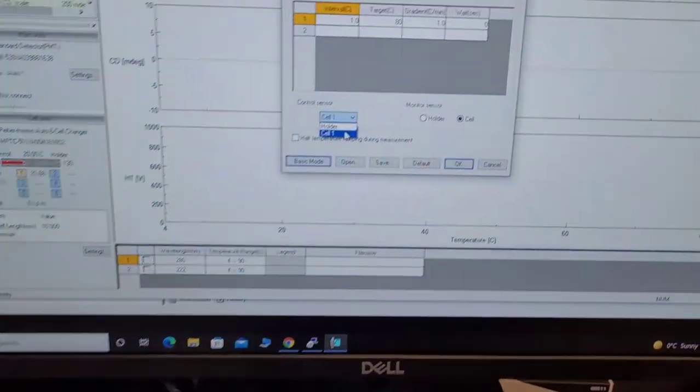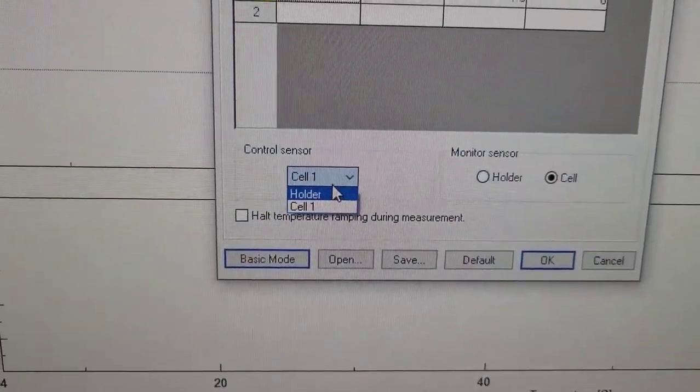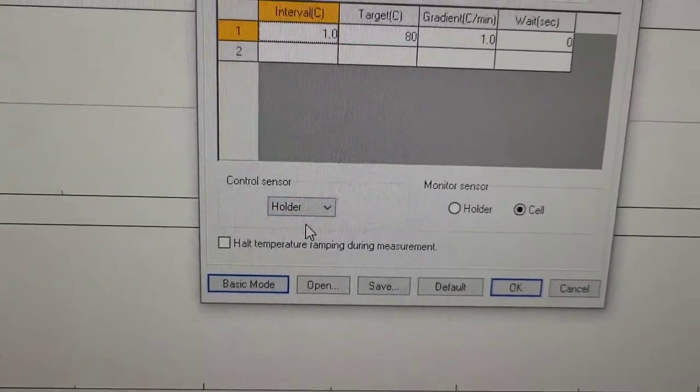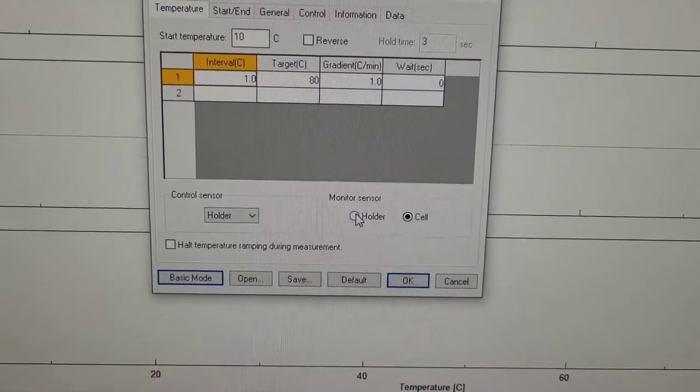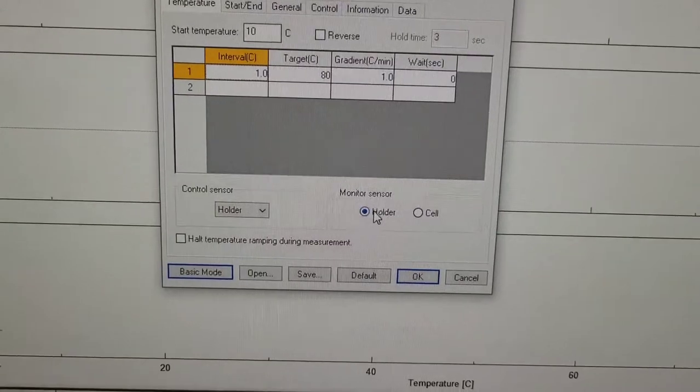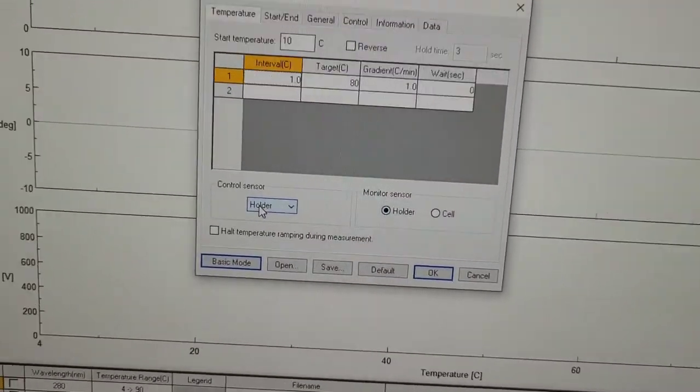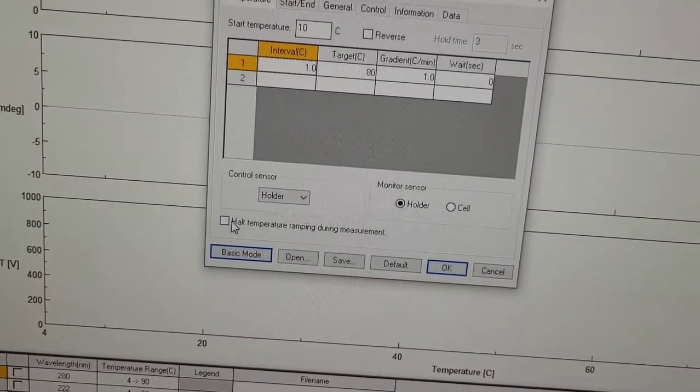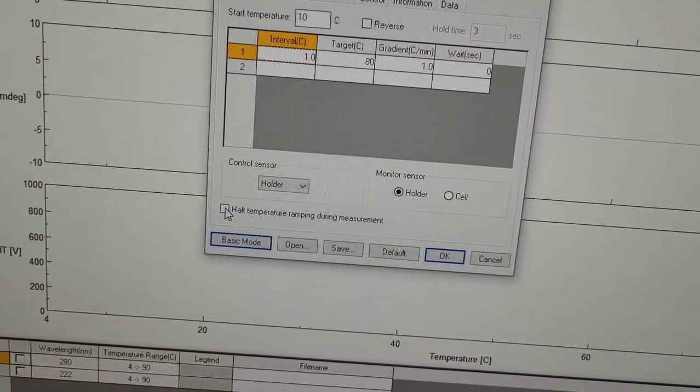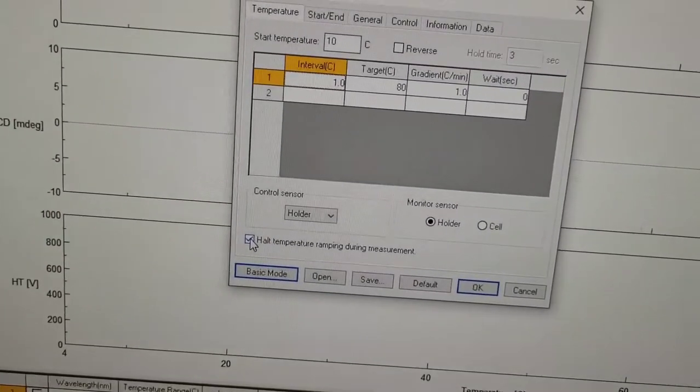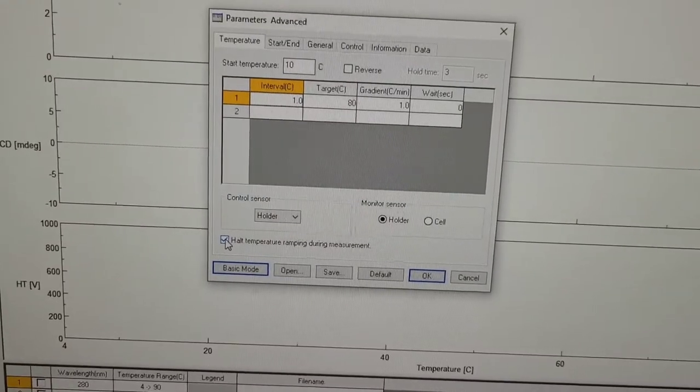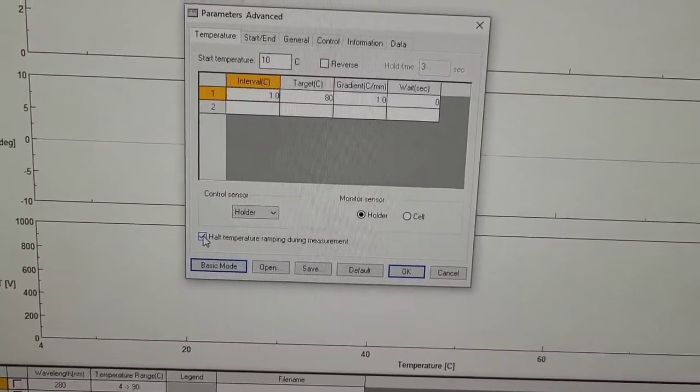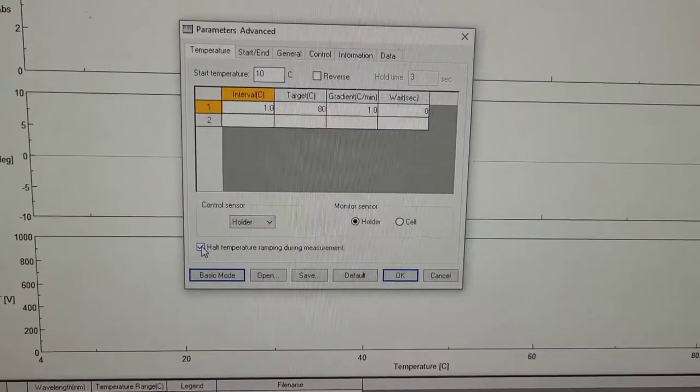So we're going to select holder for control sensor monitor sensor. We are also going to select holder. I will select halt temperature ramping during measurement because this way it is more accurate. Otherwise it will keep going up while it is reading your measurement.